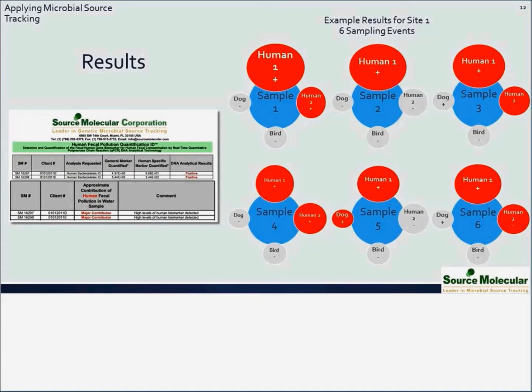And then the size of the circle is getting bigger. You see that these human results are pretty big. So this means that you have a high frequency of positive results for human, and the circles are big. That means that not only was it present, but it was present in a pretty significant concentration in most of these samples.